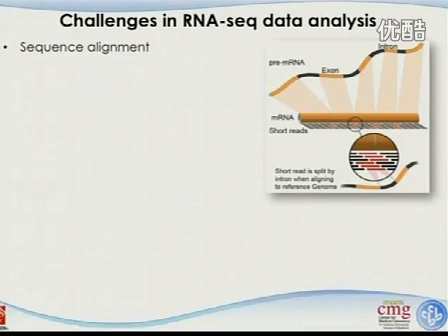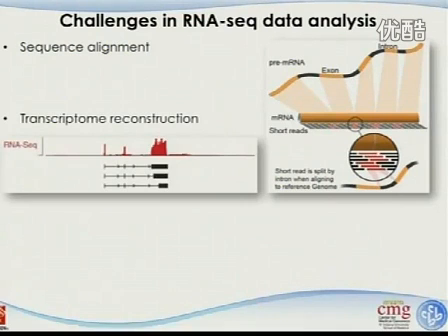At a single breakpoint here, there's one read that covers this region, and using the traditional alignment algorithm, we cannot map these reads back to the genome, because none of our aligners can take care of large gaps, which for the introns sometimes go up to 10,000 base pairs. So there's no way we can find it. We need special strategies to fix this issue.